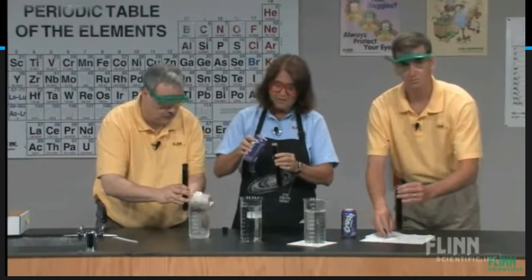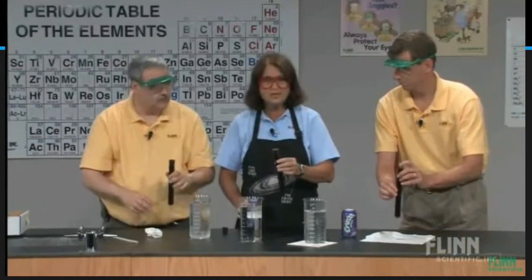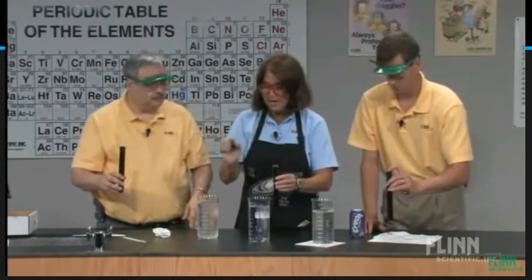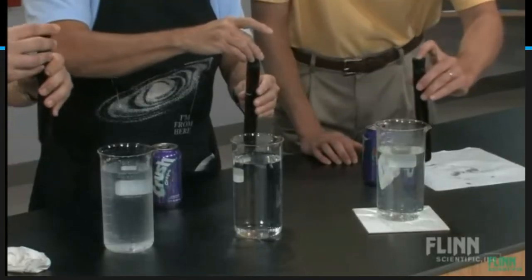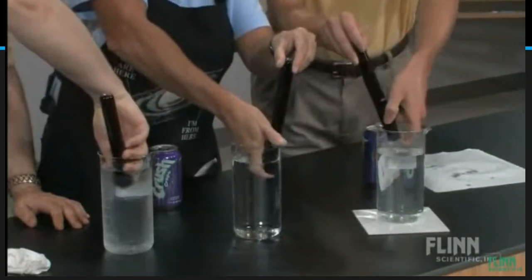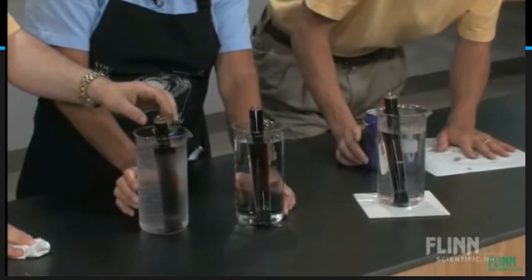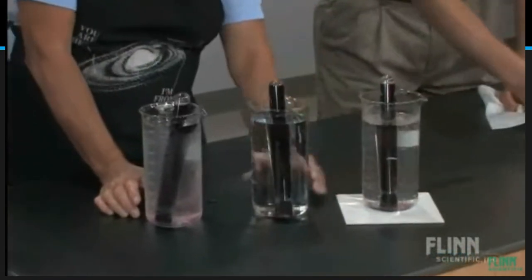You can actually make this more quantitative if you predetermine exact temperatures for your hot, room temperature, and cold. It might work real nicely if you had 10 degrees higher, 10 degrees hotter, 10 degrees colder. And all we're going to do here is place our fingers over the stopper. We're going to invert it beneath the surface of the liquid. Once it's there, take it all the way down to the bottom. And then we're going to move these just a little bit closer together. We want to make our observations.